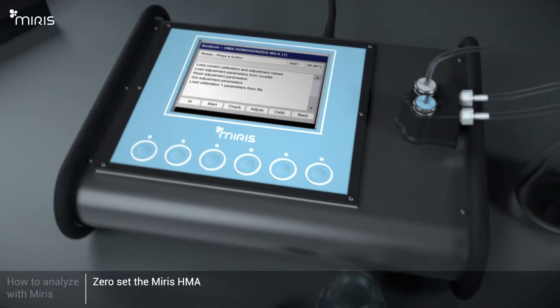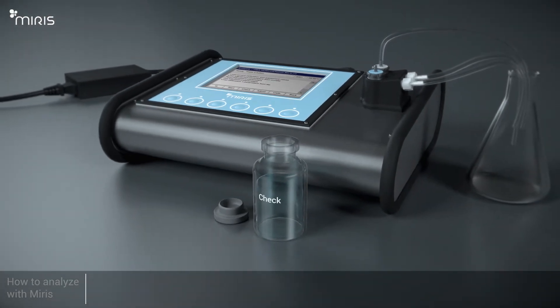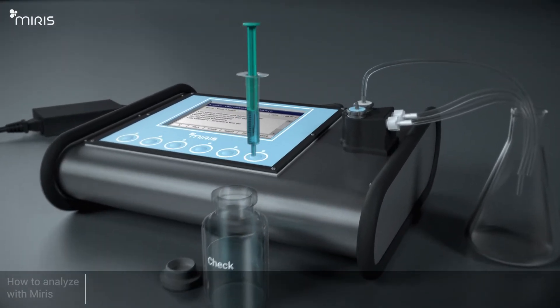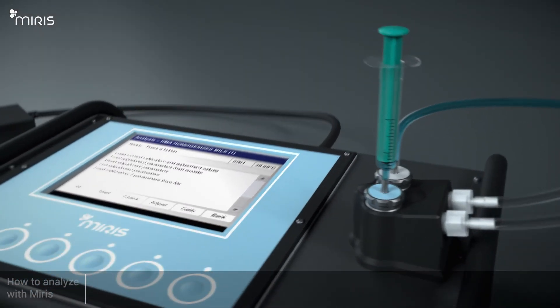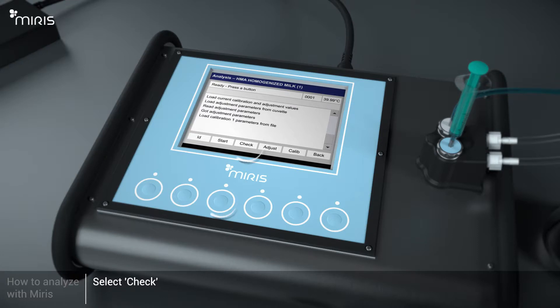Now it's time to zero-set the Meris HMA. Withdraw 3 millilitres of pre-warmed Meris Check Solution. Inject 2.5 millilitres of Meris Check Solution and leave about 0.5 millilitres in the syringe. Leave the syringe on the inlet. Select Check to begin the zero setting of the Meris HMA. Wait approximately 60 seconds.